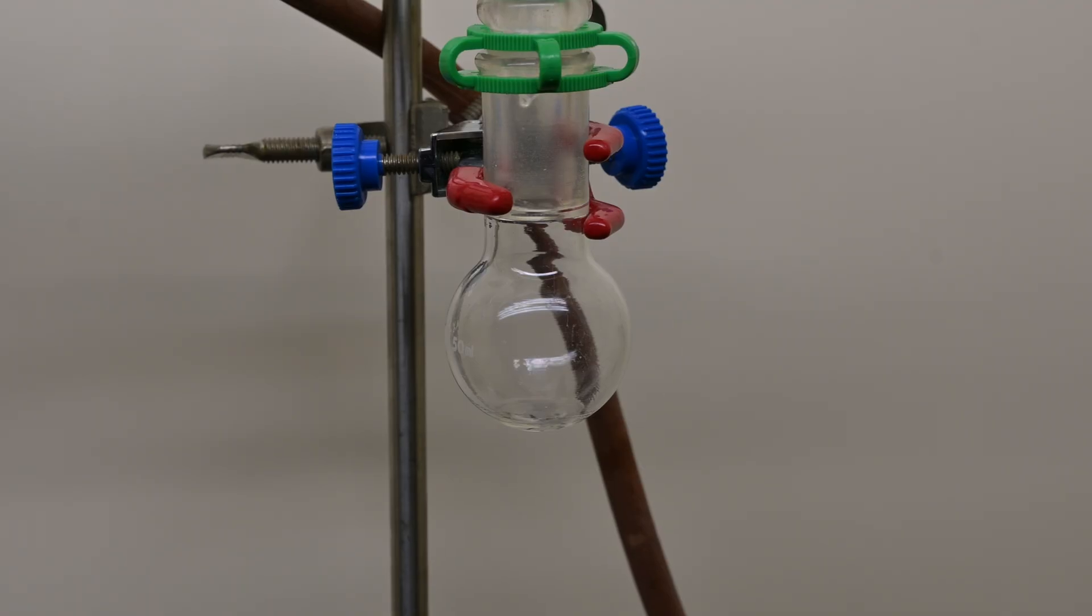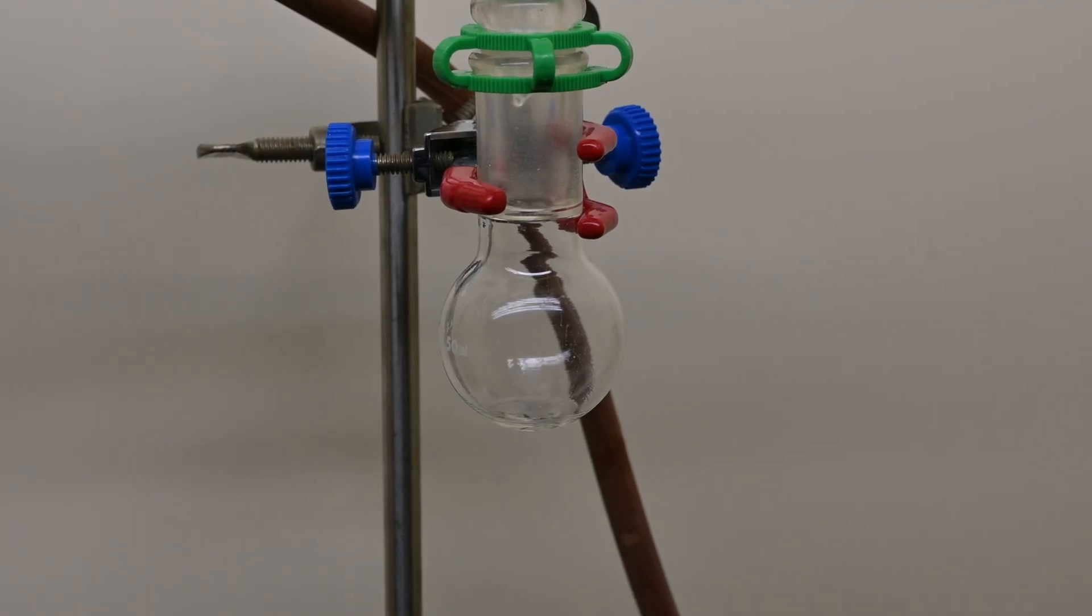By starting with the tall Vigreux column, we can gradually reduce its height as we separate the lower boiling point chemicals. This approach should help us achieve a pure distillate.